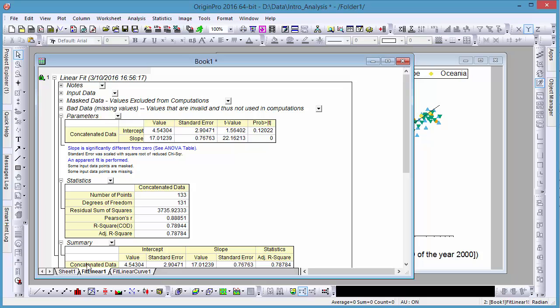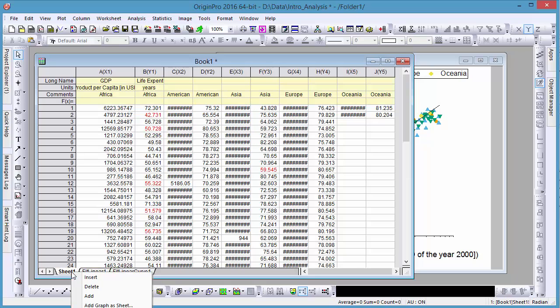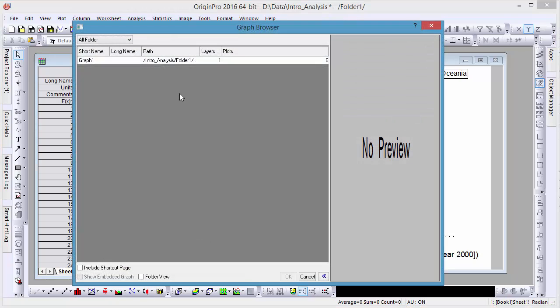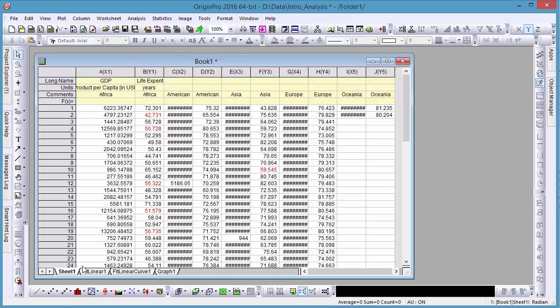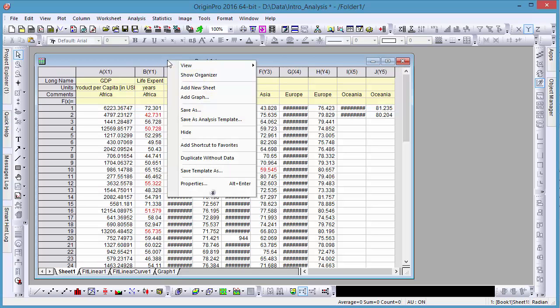And lastly, you can easily add your graph window as a new sheet as well, keeping everything contained in the same workbook, which can be saved as an analysis template for future use.